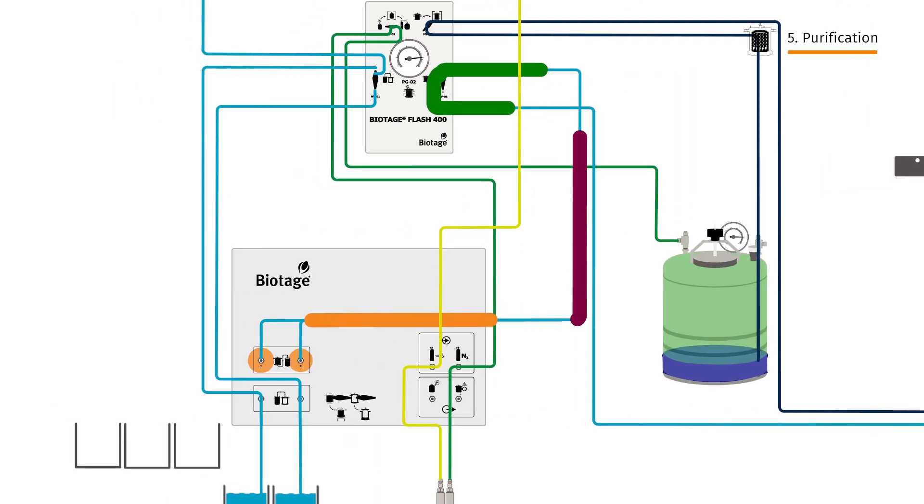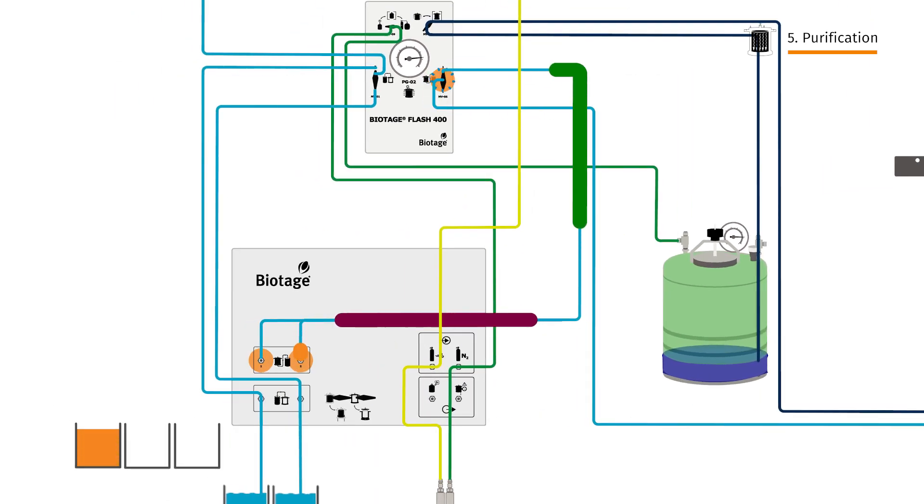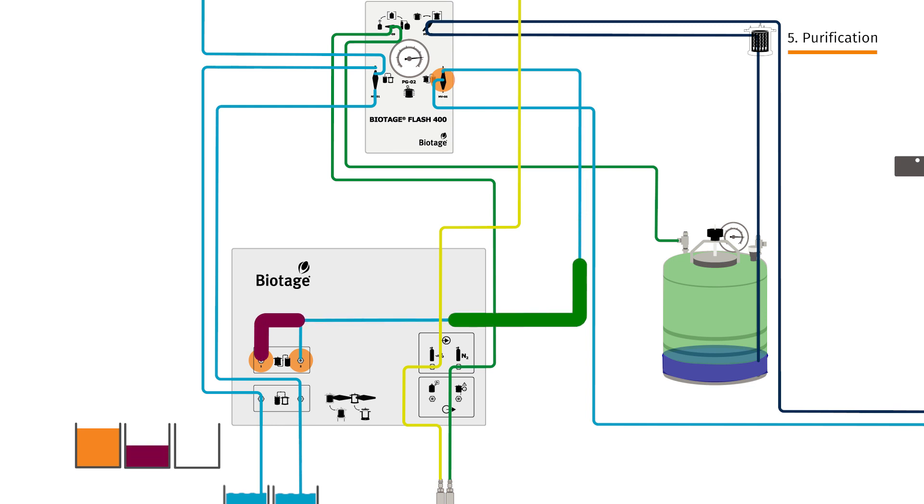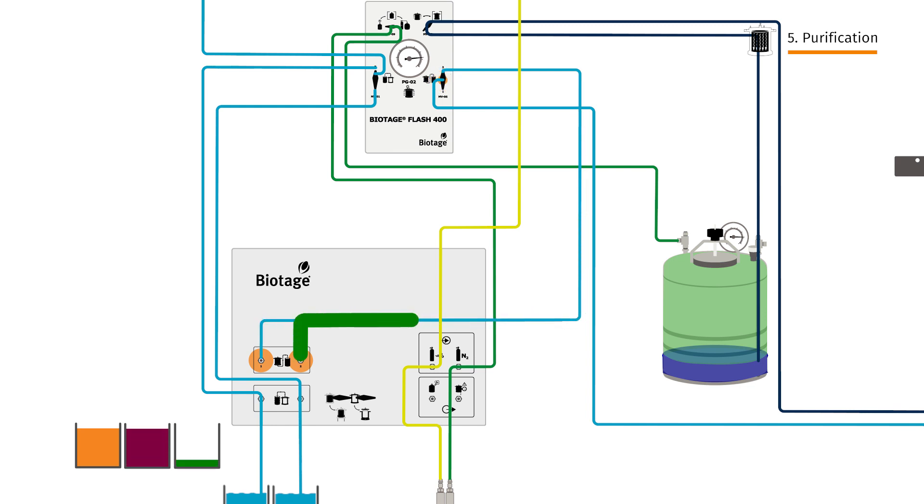Using the collection valve, we direct our fractions to one of the outlet ports on the side panel and collect them in grounded containers as they elute.